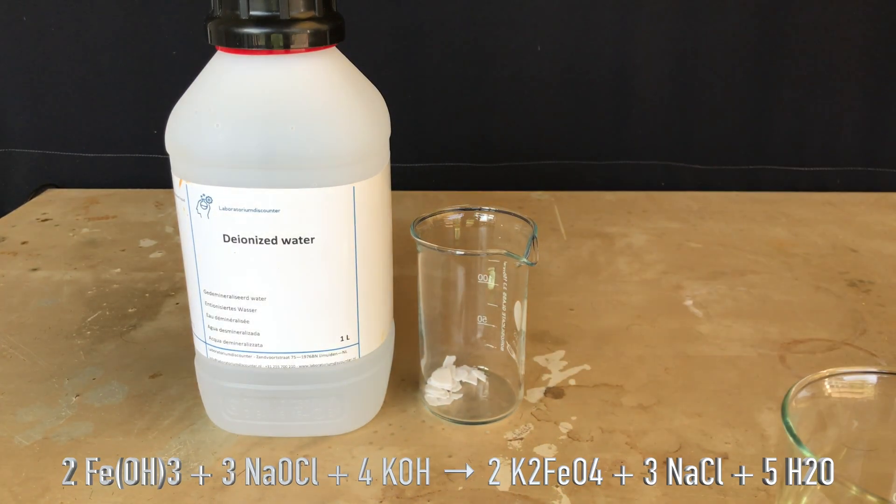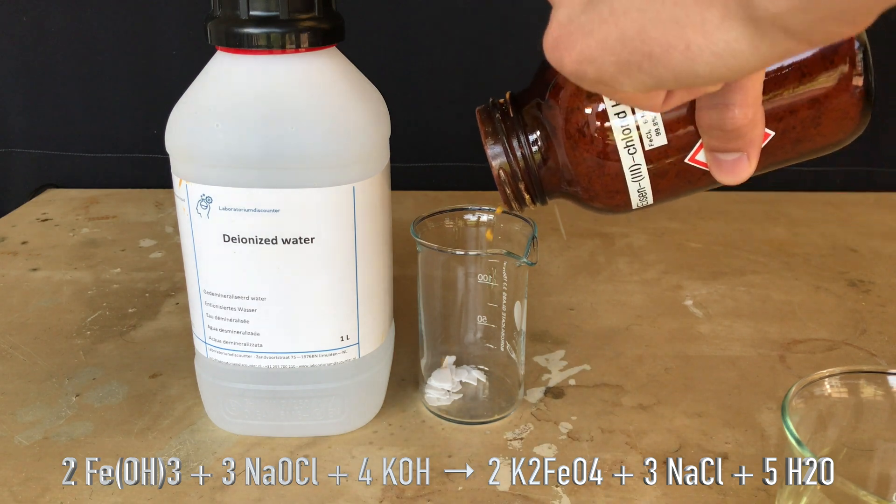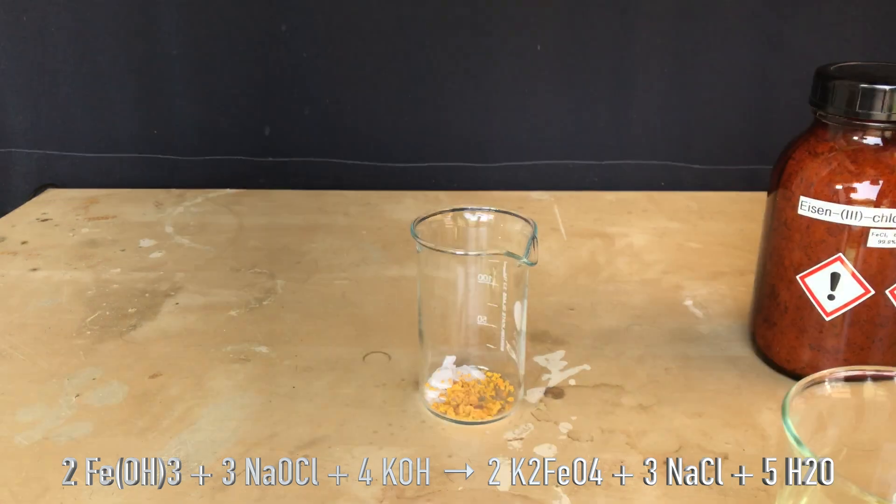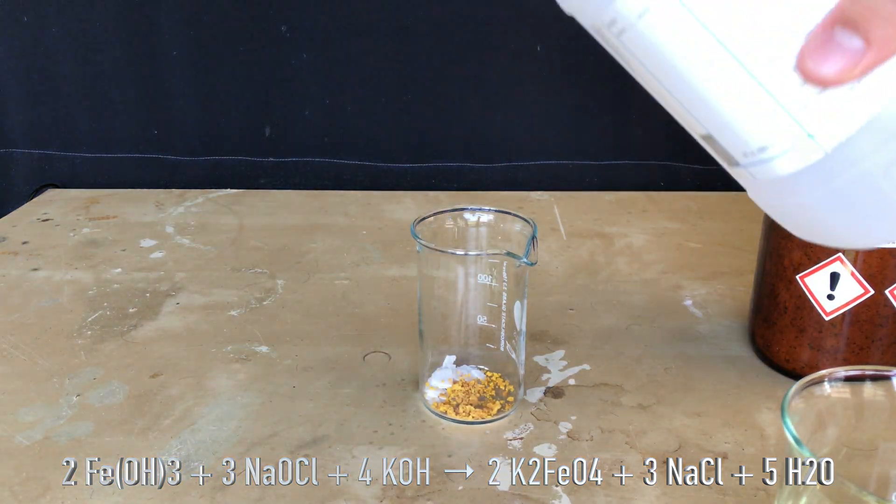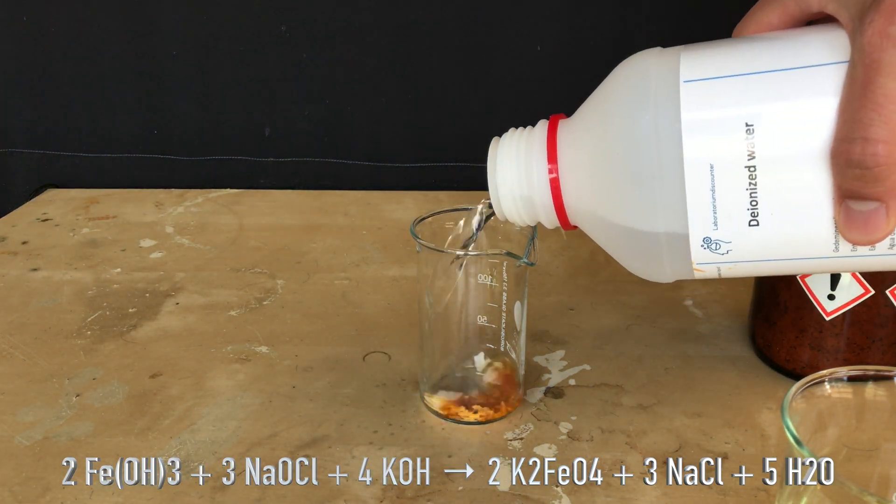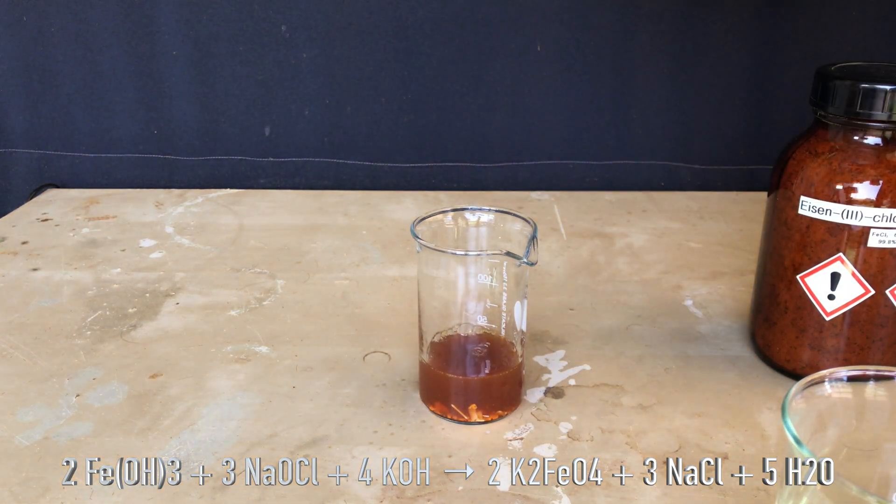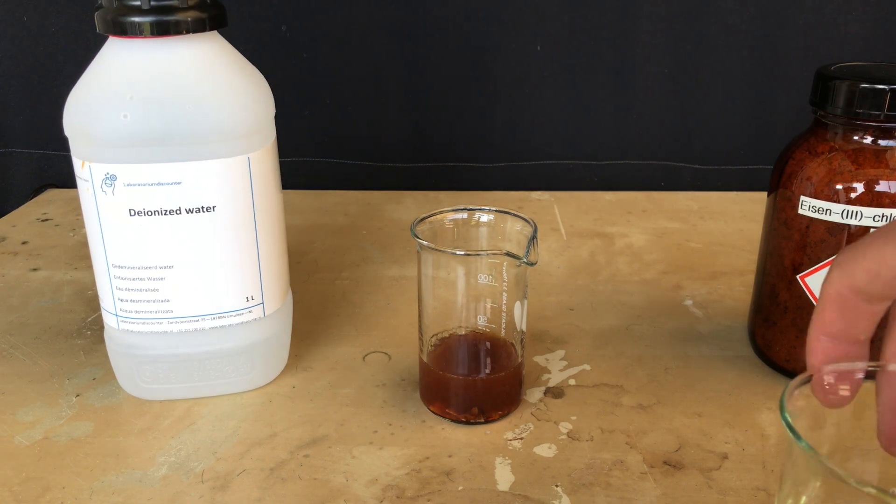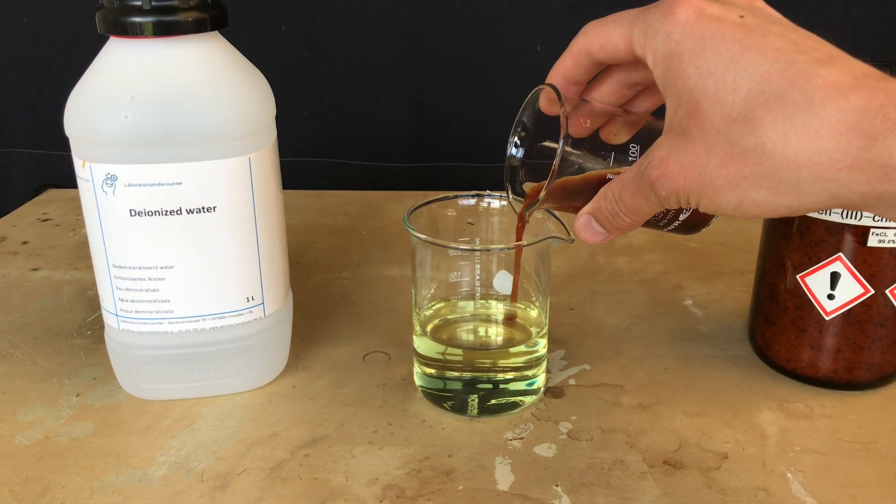One way to make potassium ferrate is to mix freshly prepared iron hydroxide with sodium hypochlorite and an excess of potassium hydroxide. To do this I put some potassium hydroxide and iron chloride into the beaker and added deionized water. Upon adding the water you immediately get this brown precipitate, which is iron hydroxide.